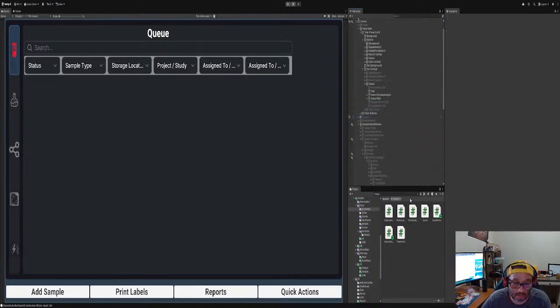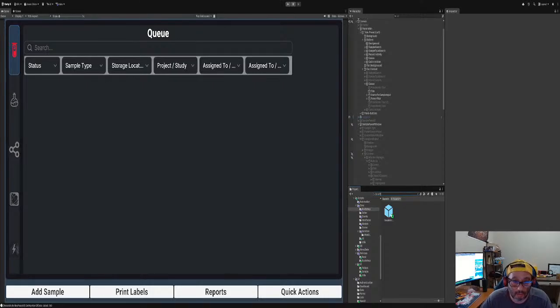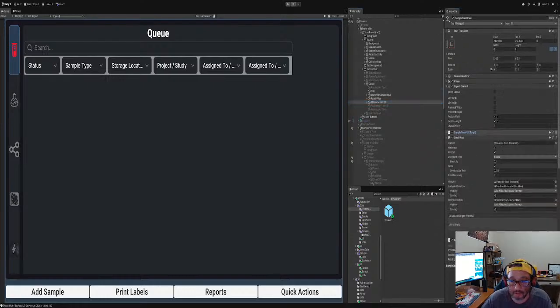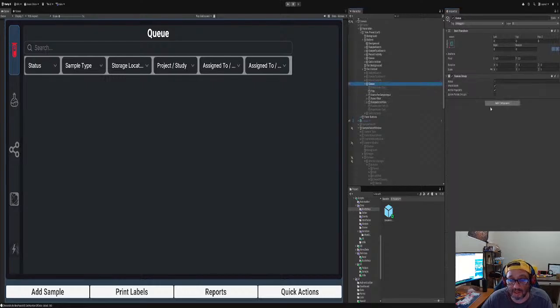We don't want that. We want the row view. There we go. I'm gonna put scroll view down here somewhere under the prefab. Come back. Get rid of this. You don't need that no more. For this, remove that, and then here on the scroll view, you want that to have the Q panel. Panel view, right? Boom.